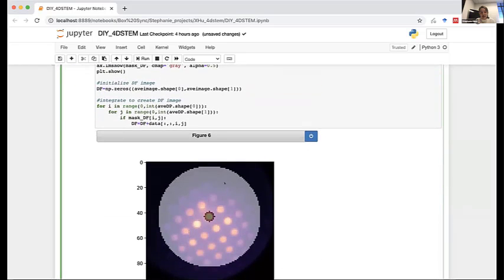So I've basically created a detector now that is between these two rings, and this is going to be my dark field detector. You could tune this. This is one power of scanning diffraction, the same thing as in Digital Micrograph that Anna showed. You're setting your dark field to be just right outside your central disk, but you can change your inner and outer diameter. So from the same data set, you could do a HAADF image, a mid-angle dark field, or a low-angle dark field. Here I'm integrating most of the dark field region to get an image.